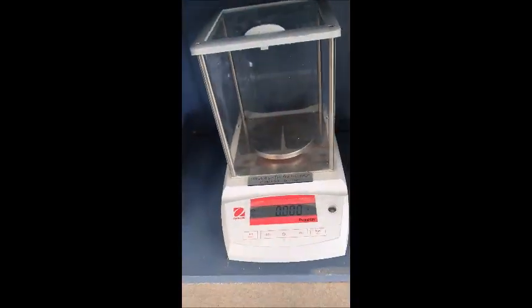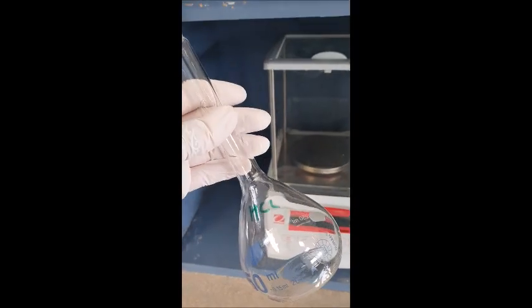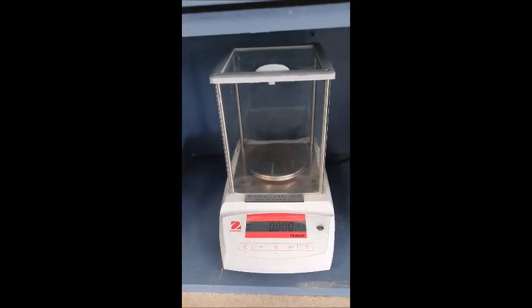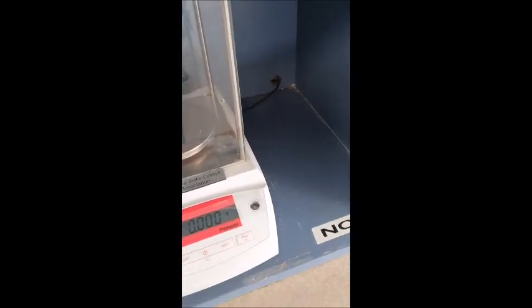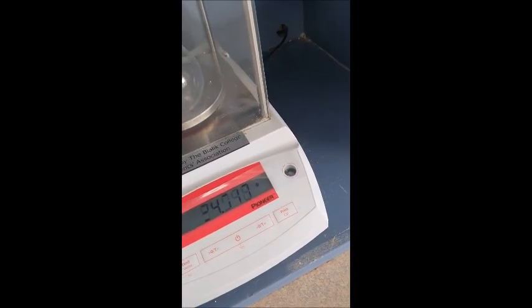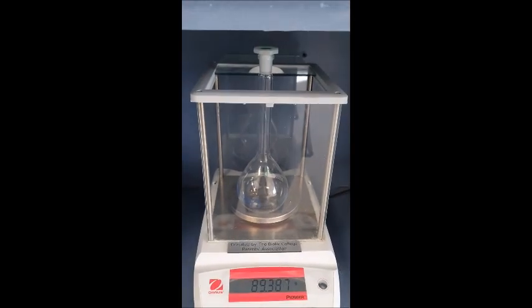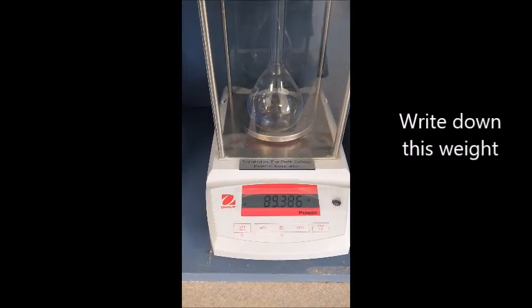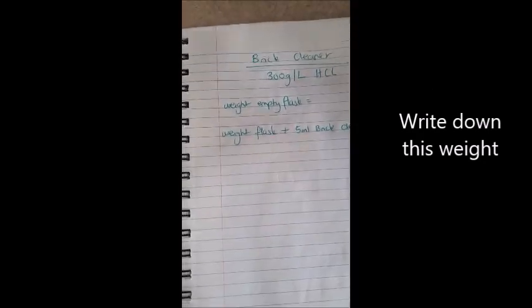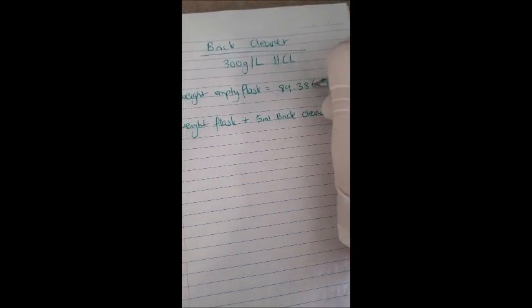Alright, so the first thing we need to do is we need to dilute that because it's very strong and you can't titrate with concentrated acid because it just fumes everywhere and it's unstable. So we're going to dilute it and to do that really accurately we need to first weigh the empty standard flask. That's 89.386 grams.